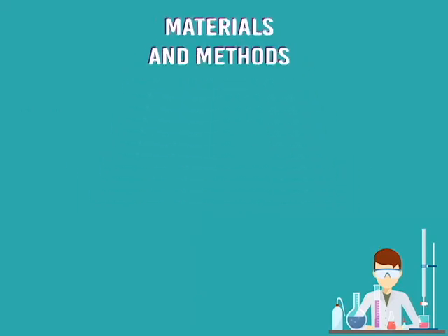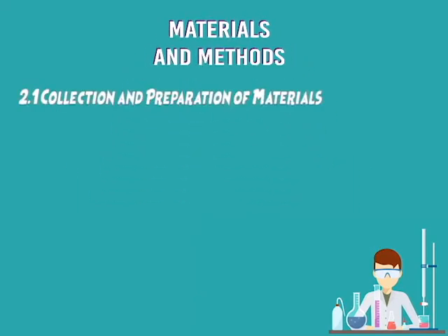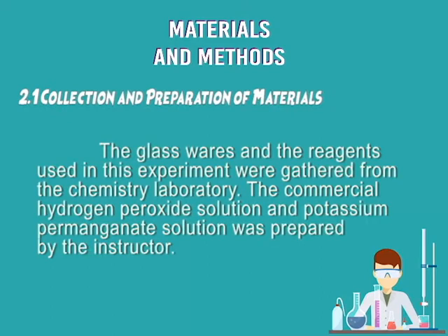Materials and methods. For the collection and preparation of materials, the glasswares and reagents used in this experiment were gathered from the chemistry laboratory. The commercial hydrogen peroxide solution and potassium permanganate solution were prepared by the instructor.